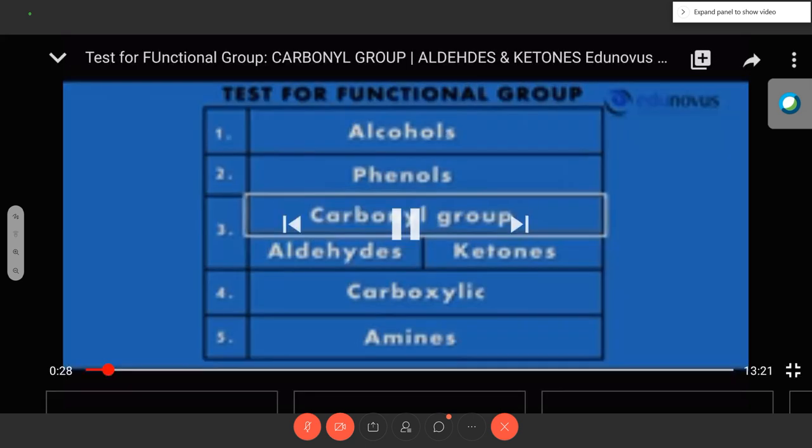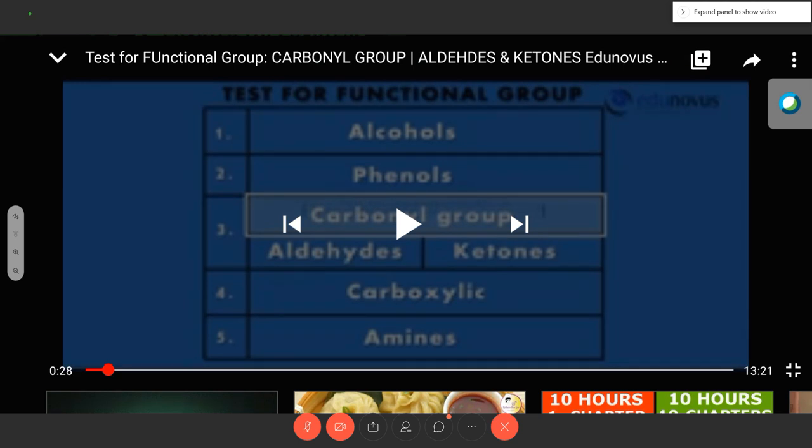So what is this video saying? First we will test for the carbonyl group, and then the respective aldehyde group and ketone group.